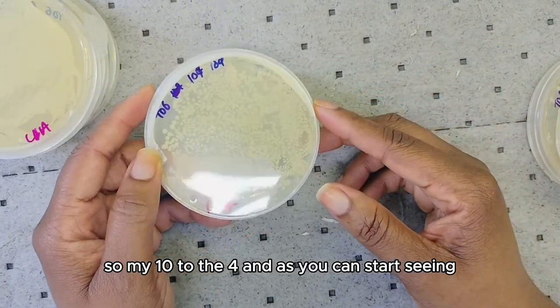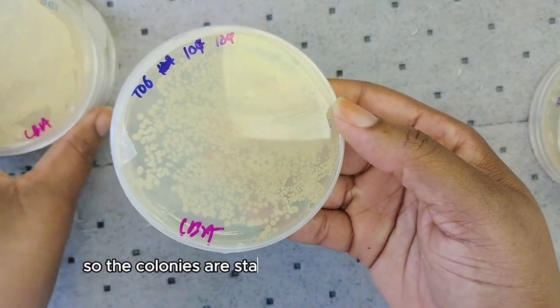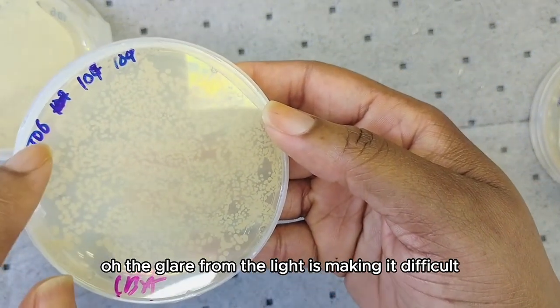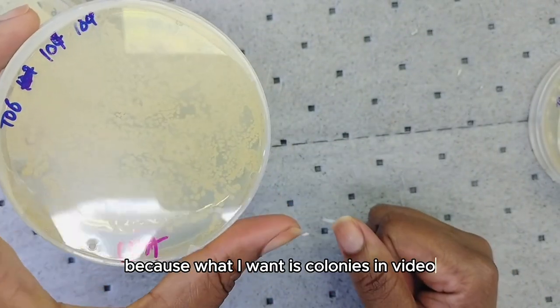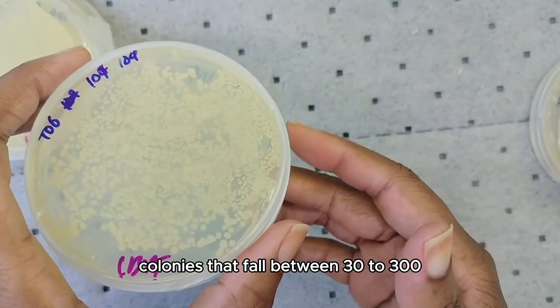From this I took 1 mL and put it in the fourth tube — my 10 to the 4. As you can start seeing, we're getting more individuals; the colonies are starting to form into individuals. The glare from the light makes it difficult, but you can see the individual colonies. It's still too concentrated to count.